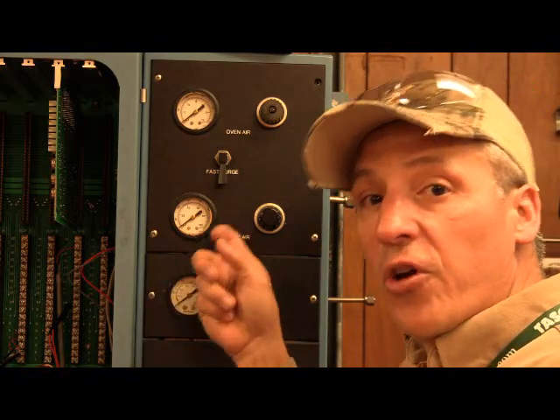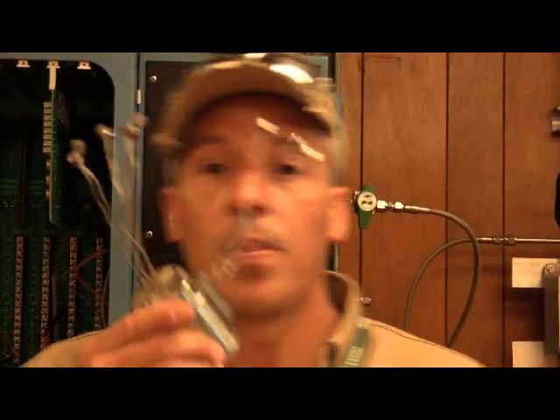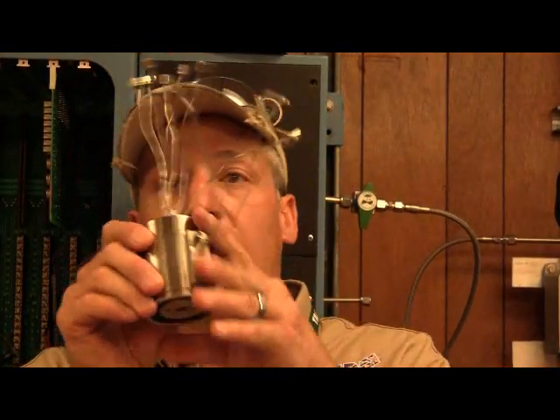Valve air to stroke your valves inside of your oven. If you're using one of these, then you're typically going to have model 11 valves. Model 11 valves need like 60 PSI. No more, no less. What is a model 11 valve? This is a model 11 valve.